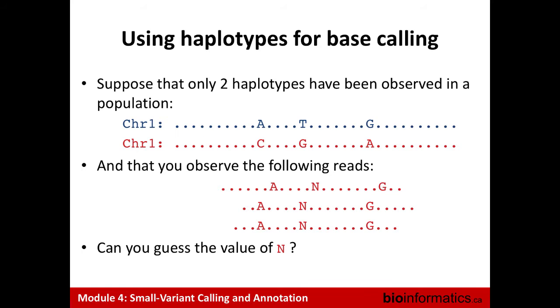Okay, so you will say there's a high probability that at this position I've got a T. This is what we do when we call imputation. When we have a region where, for example, we lack coverage, we don't have enough information to call a real variation, then we can use the population to grab information from other resources and introduce it in your data.